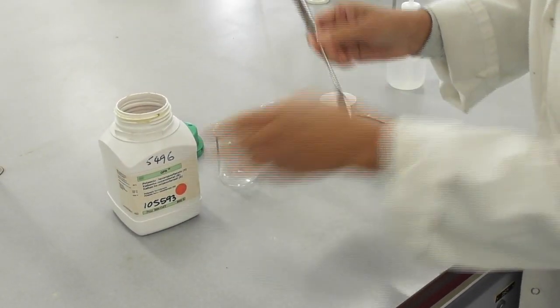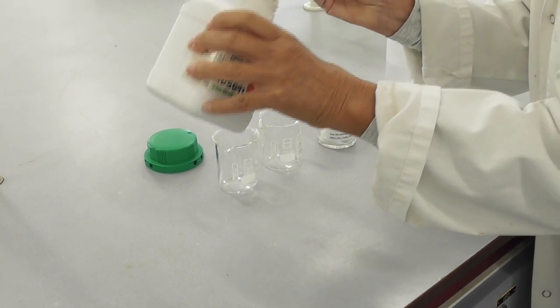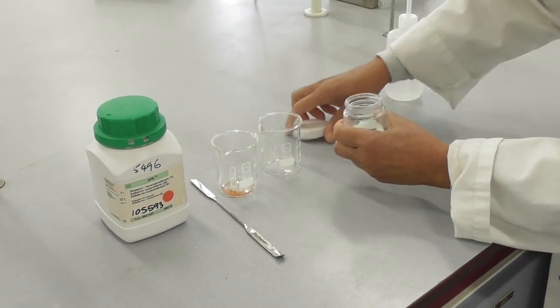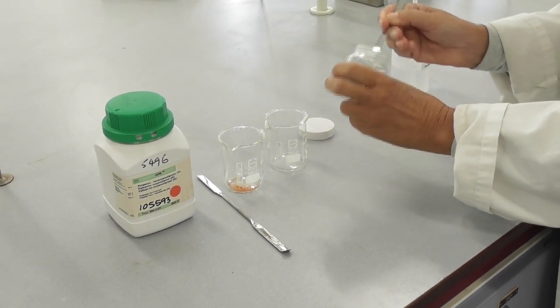I add a very small amount of the iron 3 compound ferricyanide into a small beaker. Into a second beaker I add a small amount of iron 2 sulfate.